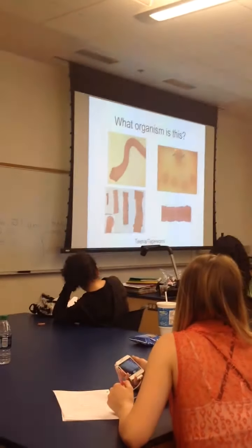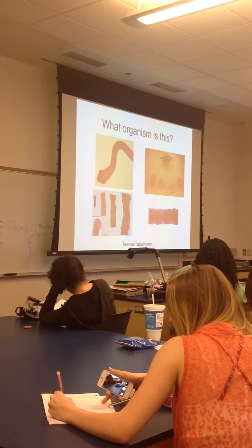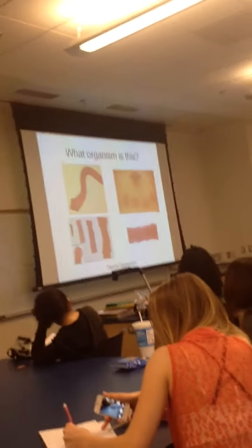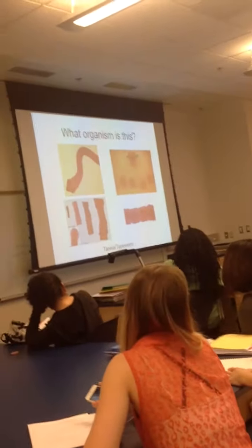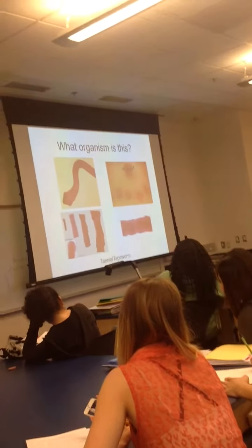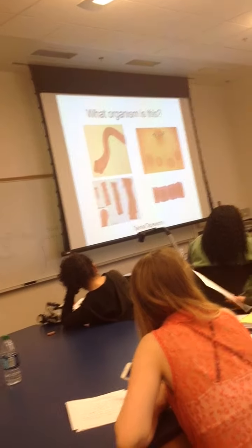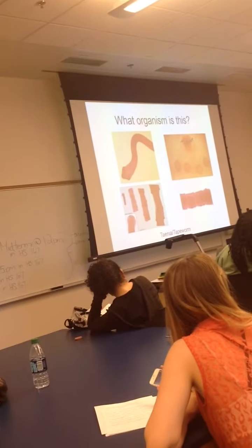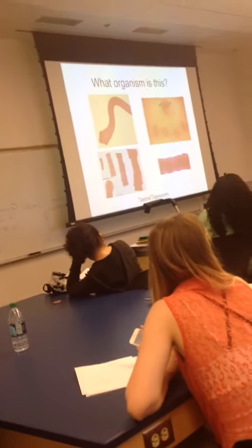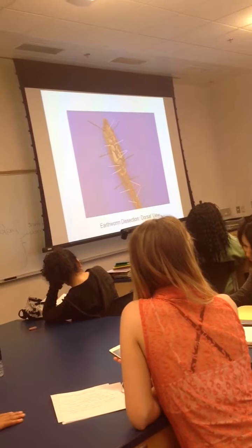This is the magnification of the scolex. We have these little hooklets. This is what burrows into your intestinal wall. And then we have the suckers that help with attachment. So we have this very obvious scolex, and we have all these different segments that you had to look at: your scolex, your immature, and your two mature sections. So it was the only segmented flatworm that we looked at. All right. That's it for slide organisms.